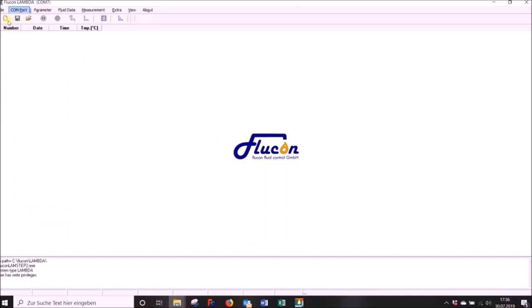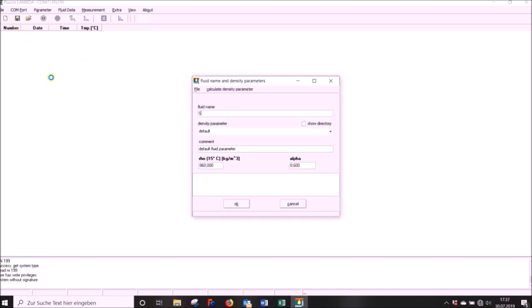This is what the program window looks like. Start a measurement by clicking on File or on the empty sheet symbol. Now the fluid data form will be displayed and will ask you for further information on your sample. First, fill in a fluid name.